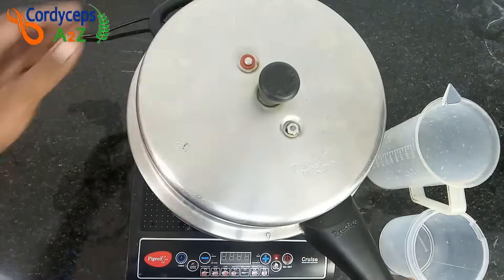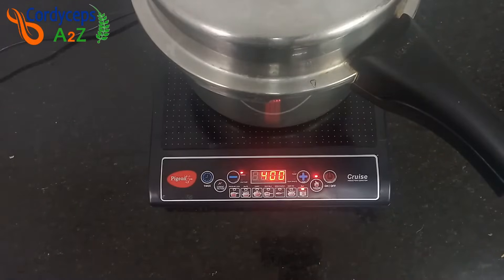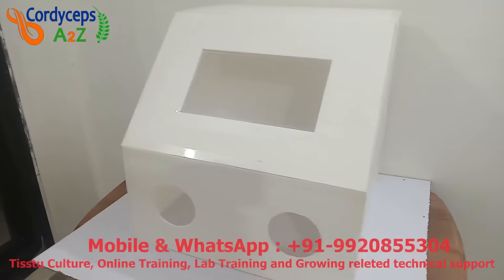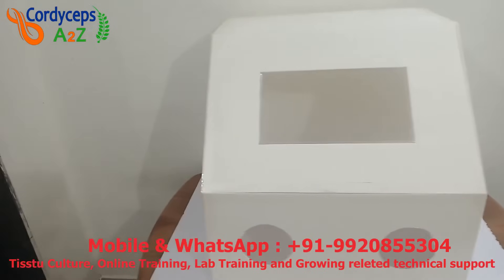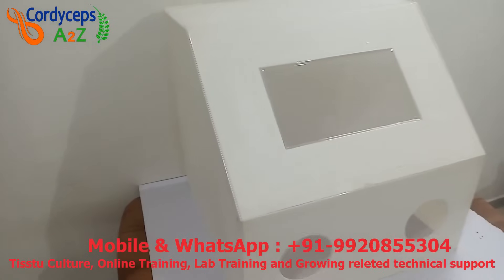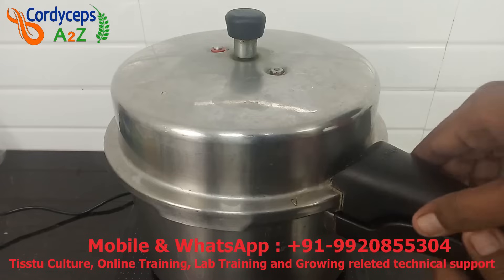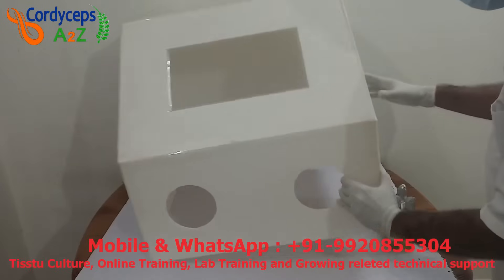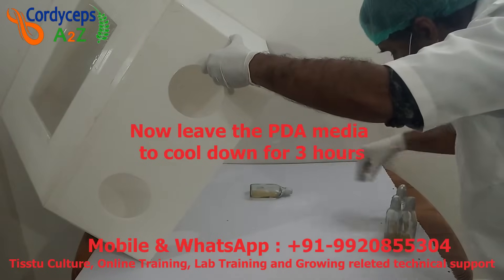Start the induction or gas stove on high flame. At the first whistle of the pressure cooker, turn the stove to low flame for 50 minutes. After 50 minutes, turn off the stove and leave the pressure cooker for 10 minutes to cool down. This is my inoculation box — I will use it as a substitute for laminar airflow. Before use, clean the inoculation box inside and outside properly with 70% isopropyl alcohol. After 10 minutes, open the pressure cooker and put the bottles in the inoculation box in a sleep position, then leave the PDA media to cool down for 3 hours.